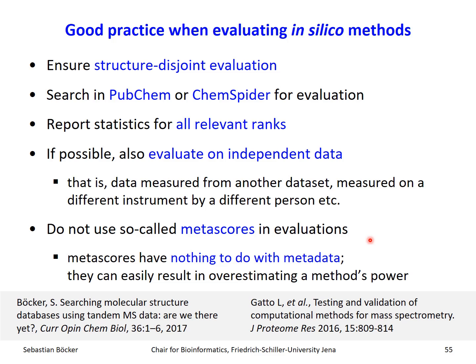Why? But for this talk, the important take-home message is that it really doesn't make much sense to evaluate a metascore and believe that those evaluation results have anything to do with reality. That is not true. This is just totally overestimating the power of these methods. One thing that I found that people confuse a little bit is they hear metascore and they think metadata, but be warned, metascores, at least the one that I'm talking about here, have nothing to do with metadata, okay?